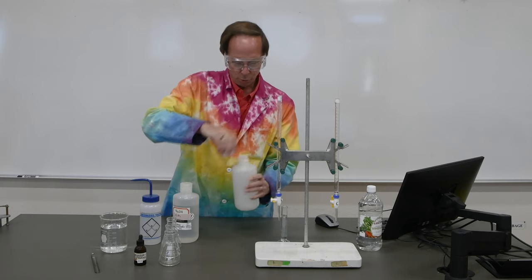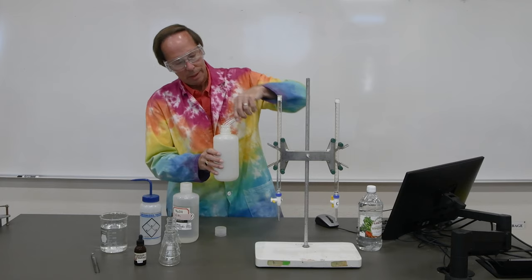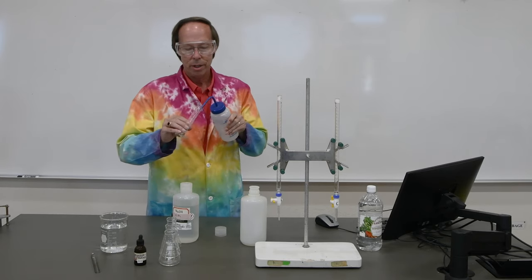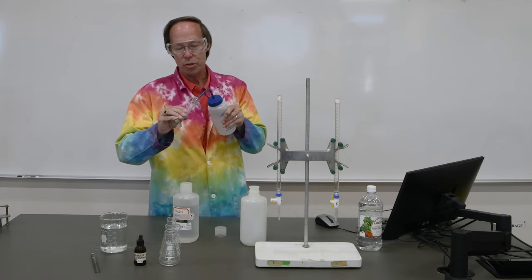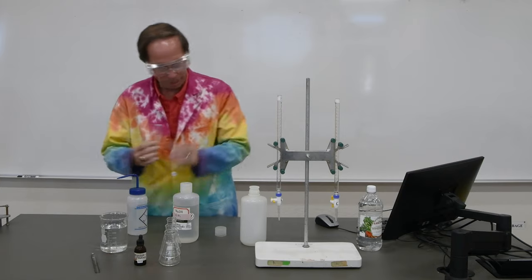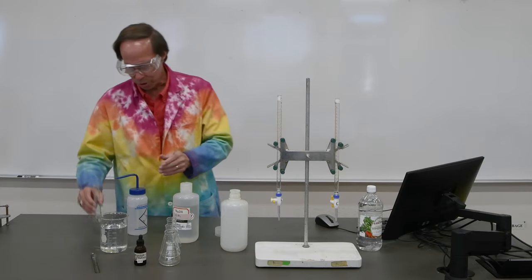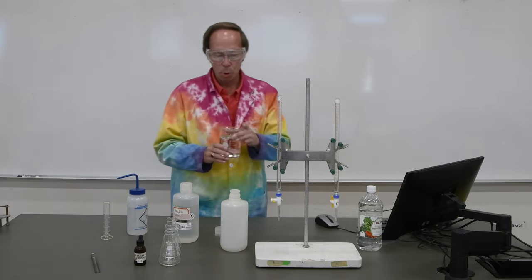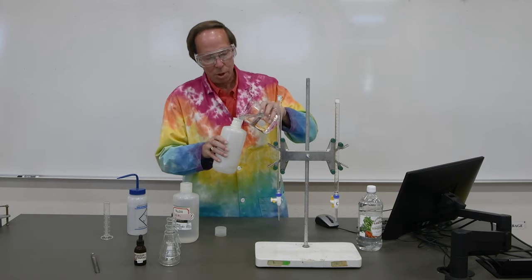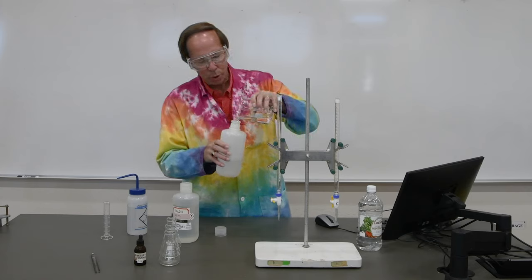We'll go ahead and put that into our clean, empty bottle. And then to make sure that we got all of the sodium hydroxide transferred, we'll go ahead and rinse out the graduated cylinder. We'll add another 25 milliliters or so of water to that. Again, the amount is not critical. And then to get the appropriate concentration, to get down to that about 0.3 molar solution, we'll add about 500 milliliters of deionized water. And that amount of dilution should get us down to just about where we want to be.